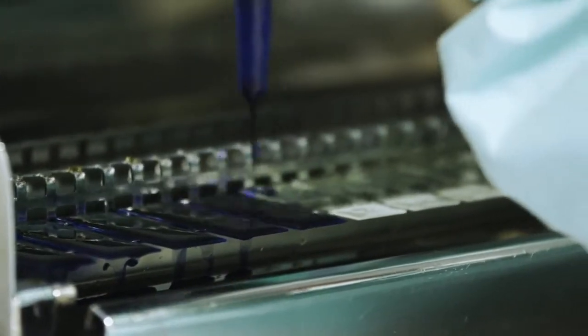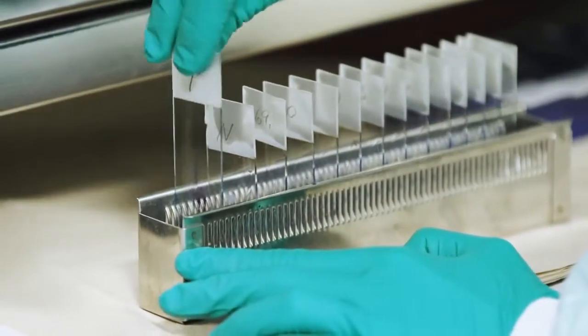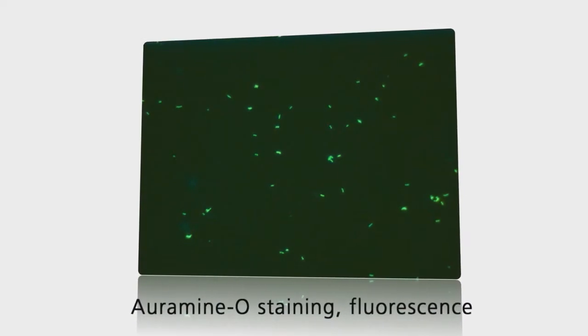Next, use potassium permanganate, methylene blue, or even ordinary ink for counterstaining. Allow the prepared samples to air dry. Under the fluorescence microscope, you will see any tuberculosis bacteria contrasted against a dark background as luminous rods.